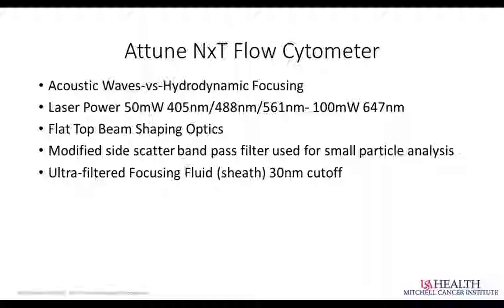So let's talk briefly about the Attune NXT. This is kind of a different beast. The Attune NXT is the only system on the market that uses acoustic waves to actually focus the cells into a very tight and uniform line as they flow past the laser interrogation point. All other flow cytometers use the tried and true principle of hydrodynamic focusing, which uses high pressure sheath going through the flow cell, which causes a swirly effect kind of and forces those cells into a tight line.